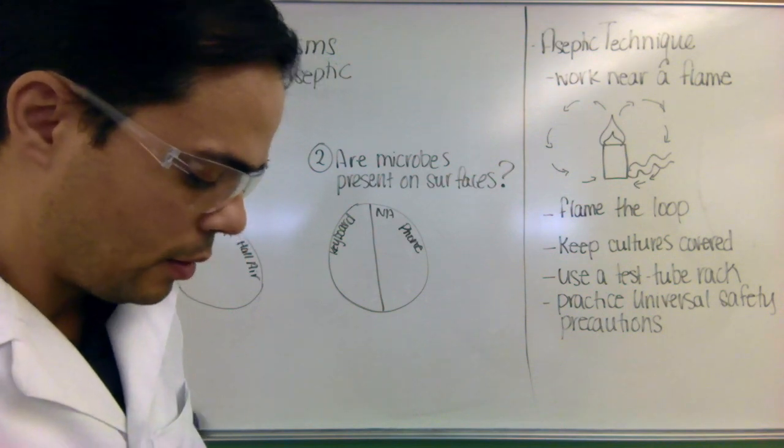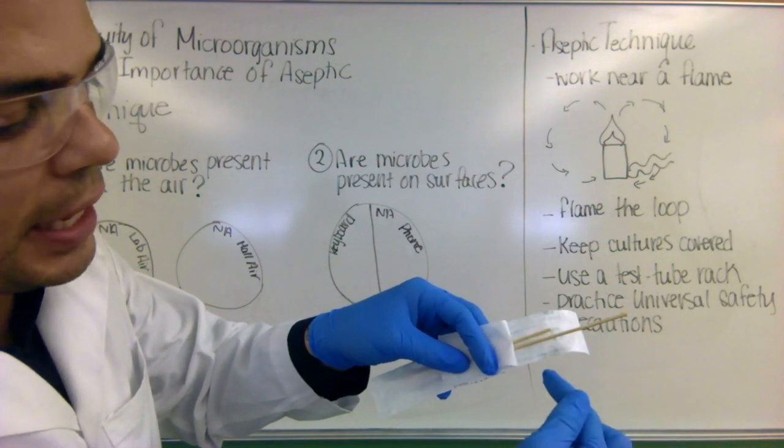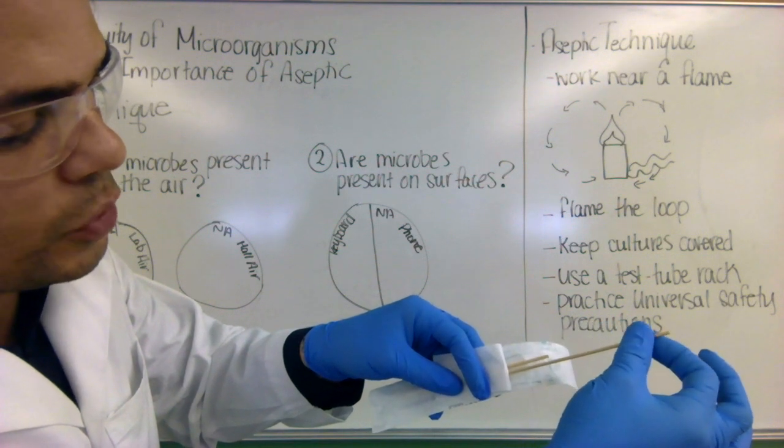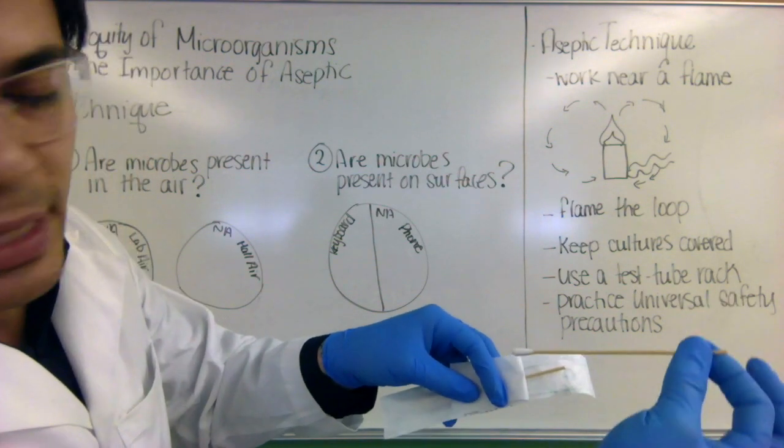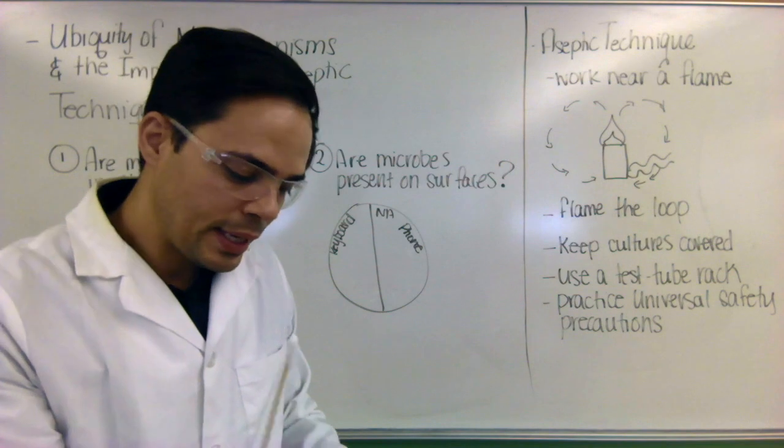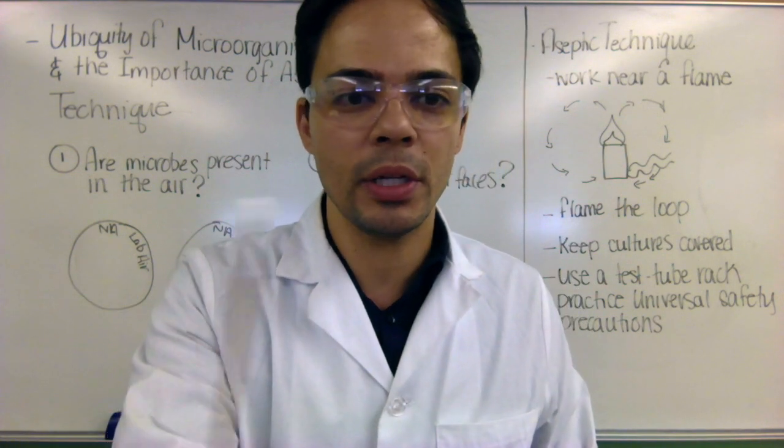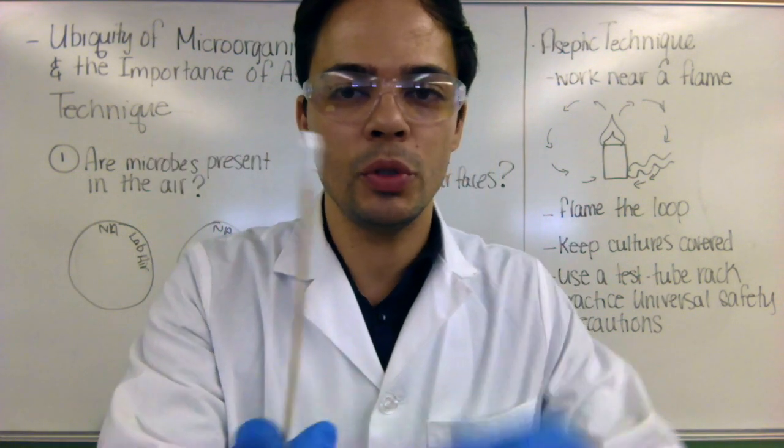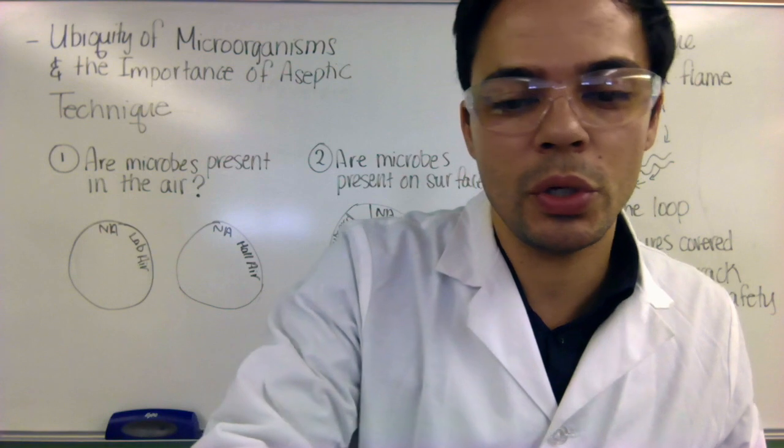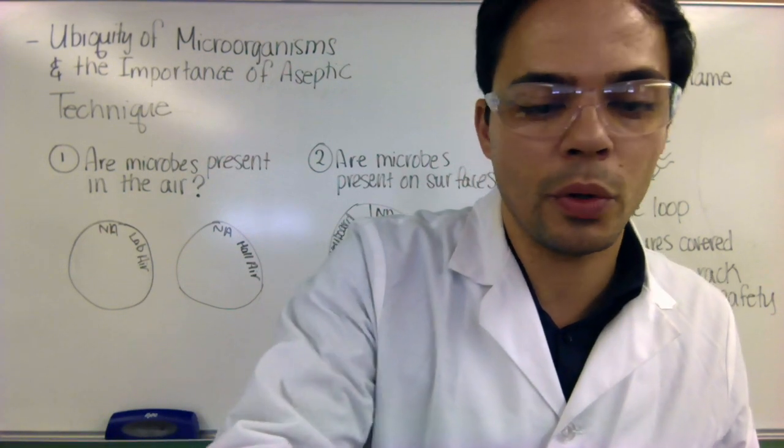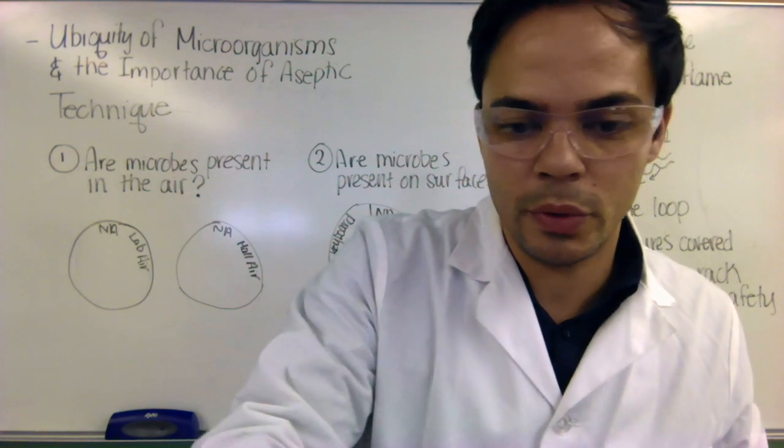So once you have labeled your plate, you can go ahead and take out the sterile swab. Now, try not to touch the sides here when you take it out because we don't want to contaminate the swab tip. It is sterile. So as I take it out, I'm just careful not to touch any sides there. Now, I want to quickly get my sample. Now I'm recording this on my computer. So I'm going to swab my keyboard right here. And as I'm swabbing, I'm actually twirling the swab to completely coat all sides. And I am almost certain that we're going to get lots of microbes growing here because I can't remember the last time I disinfected this keyboard, which is kind of gross, but it is what it is.